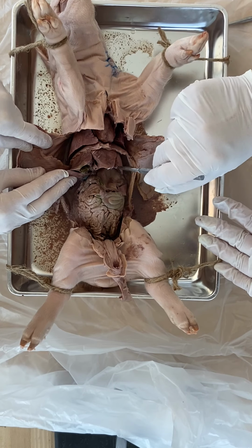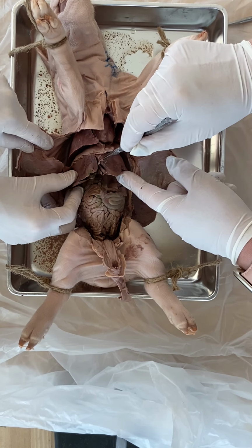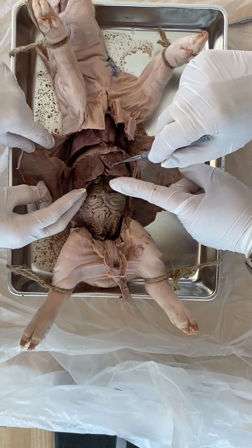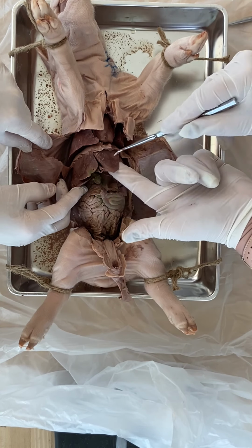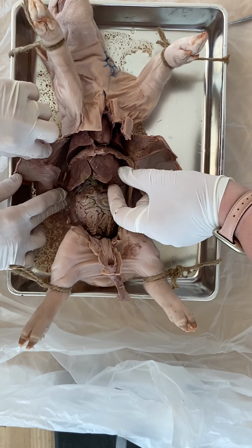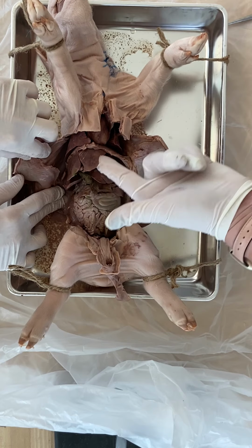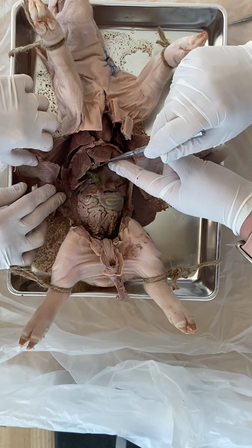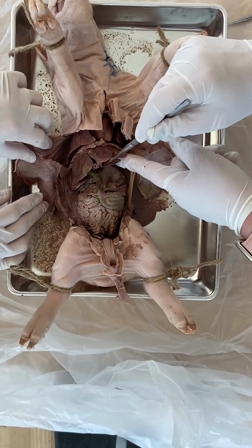So here are the lobes of the liver. 1, 2, 3, 4 lobes. Four lobes. And it's quite firm, unlike the fresh pig, which was very slippy and slidey and nice and bright red. Now, of course, it's been preserved, so it's much firmer to the touch.